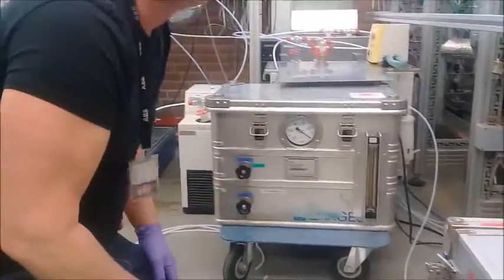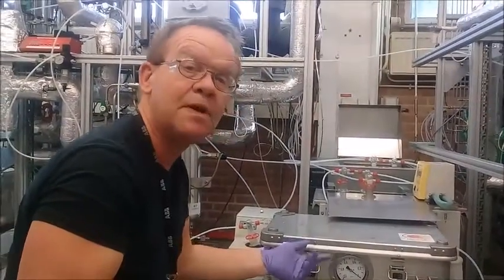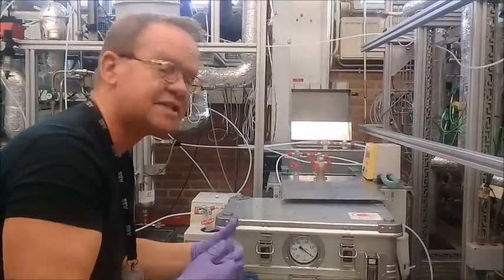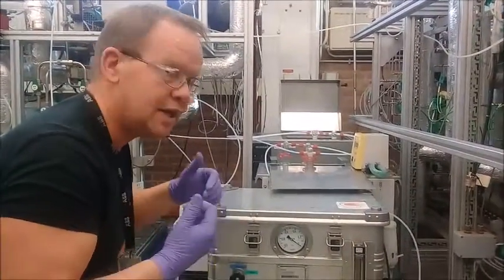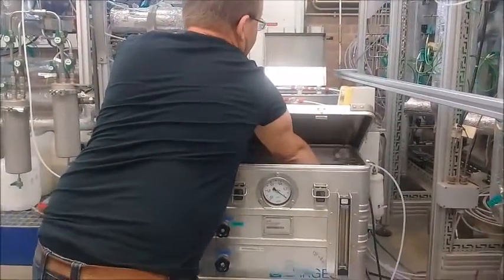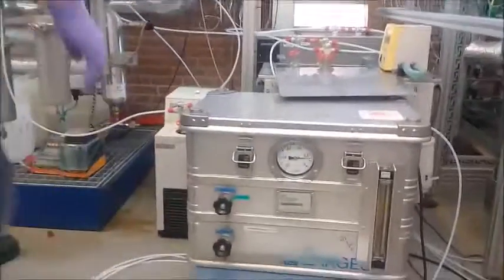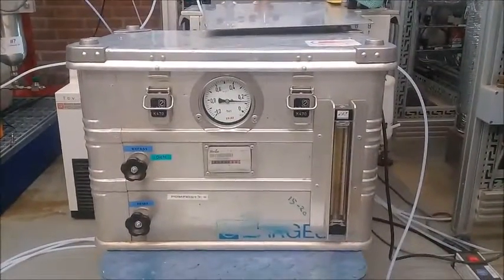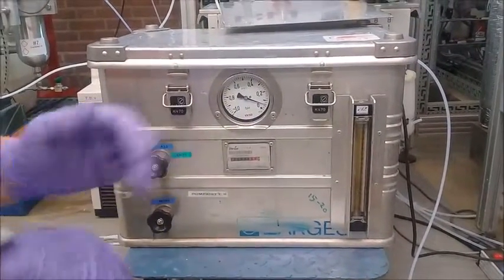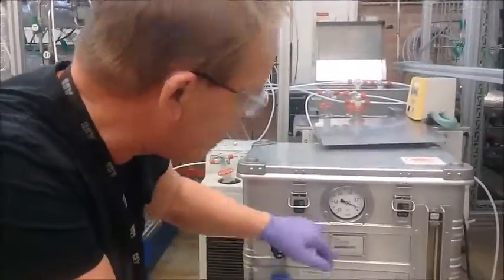And then I'll first start pumping and then check if we get a sub pressure, because if we have a sub pressure, then we know that the system is gas tight and ready to go. So that's what I'm going to start first. Then you can see the sub pressure going up rapidly. So I open the valve, and then you see the sub pressure going down, and it will stay around 0.04 bars, which is around 40 millibars of sub pressure going to the system.